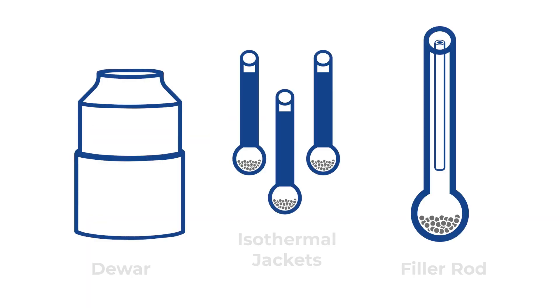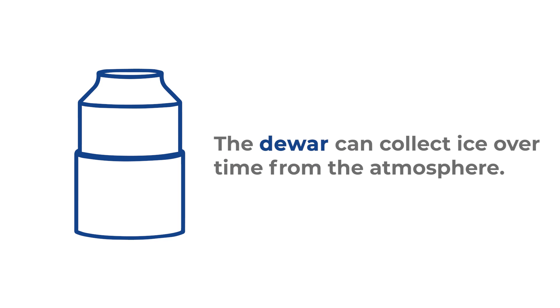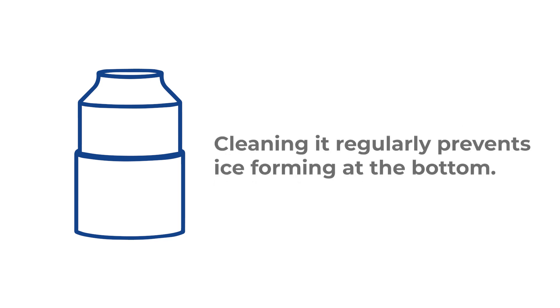Other ways to minimize air factors are by taking care of the tools and using them appropriately for an analysis. The dewar can collect ice over time from the atmosphere due to its temperature. Cleaning it regularly prevents ice forming at the bottom, which can accumulate over time and consequently break the tubes.